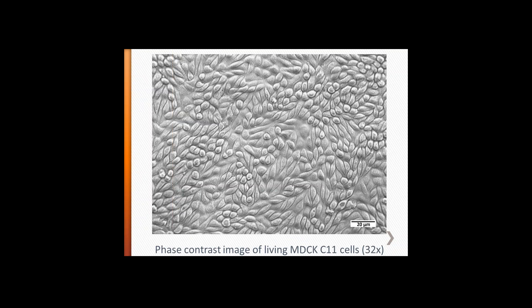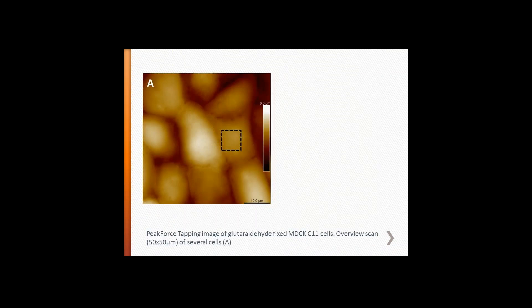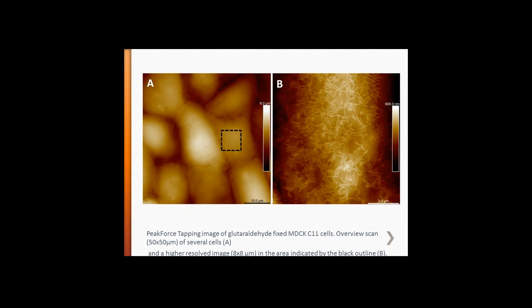These are MDCK-C11 cells as a phase contrast image, and as you can see, the height differences within the cell layer are large — challenging for a common short tip due to shadowing. Using the Peak Force QNM probe, we first imaged glutaraldehyde-fixed MDCK-C11 cells, with no shadowing effect visible. In the indicated square, a higher resolution scan reveals microvilli squeezed down to the surface — nicely shaped but not in their native configuration. Because they are fixed, they are stiff and not flexible, making them easier to image.